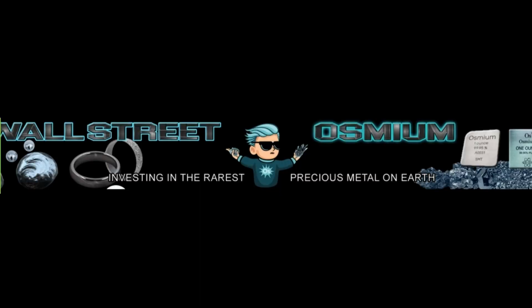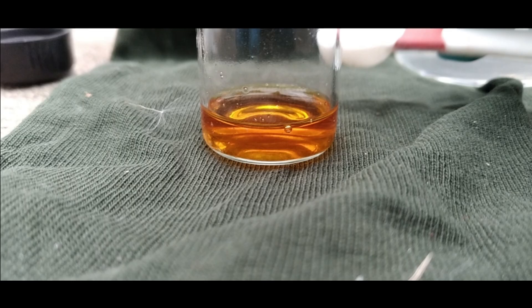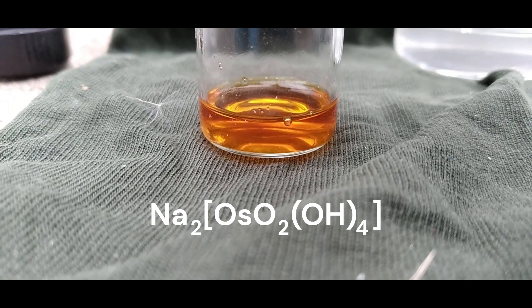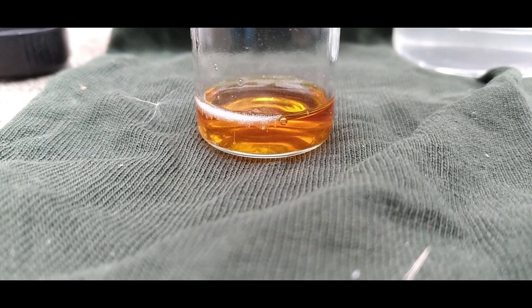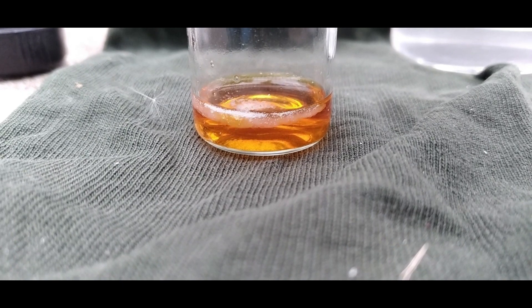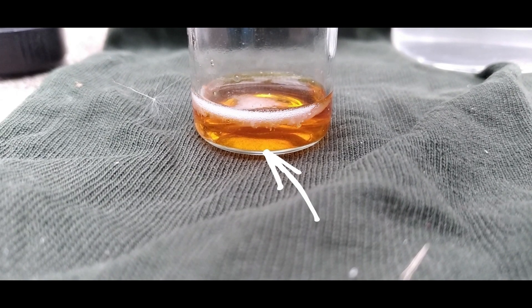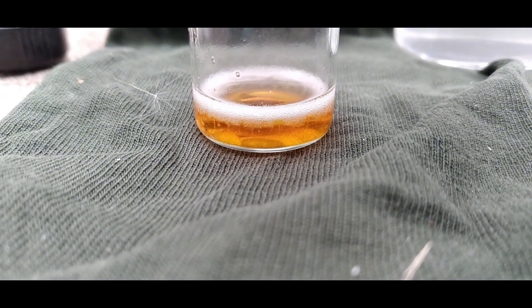However, osmium's compounds are a profoundly different animal. To start with, we'll be looking at a compound called osmaltetraamine chloride. To make this compound, I start with a dilute sodium osmate solution. This compound is in the plus-6 oxidation state. To it, I add solid ammonium chloride. Fairly quickly, you'll notice a yellowish precipitate forming on the bottom of the vial. This is our osmaltetraamine chloride forming.